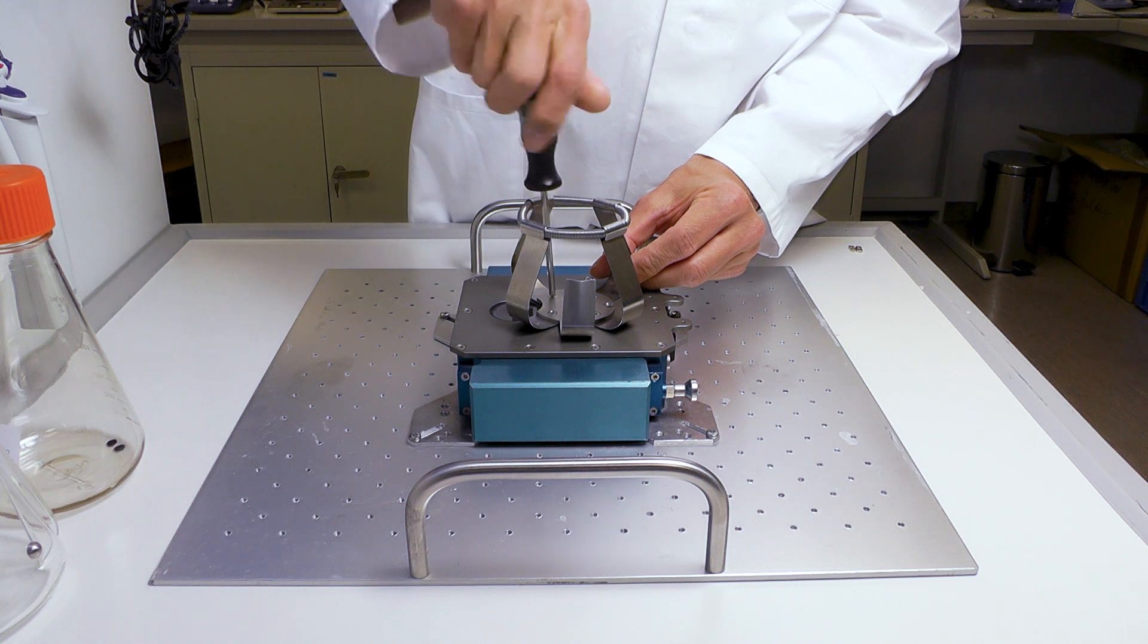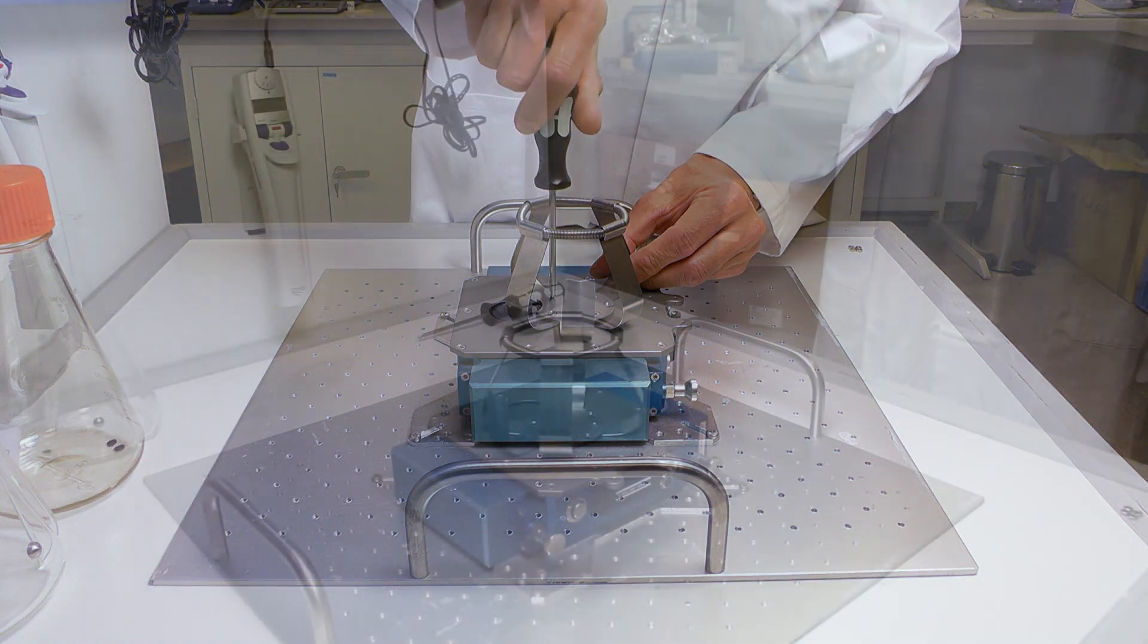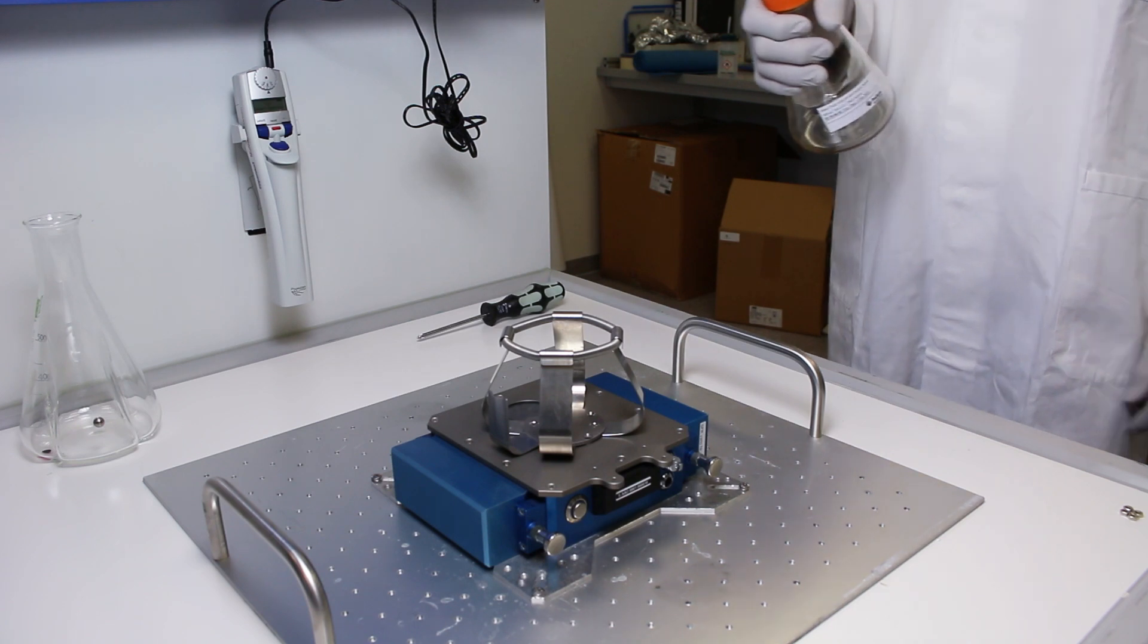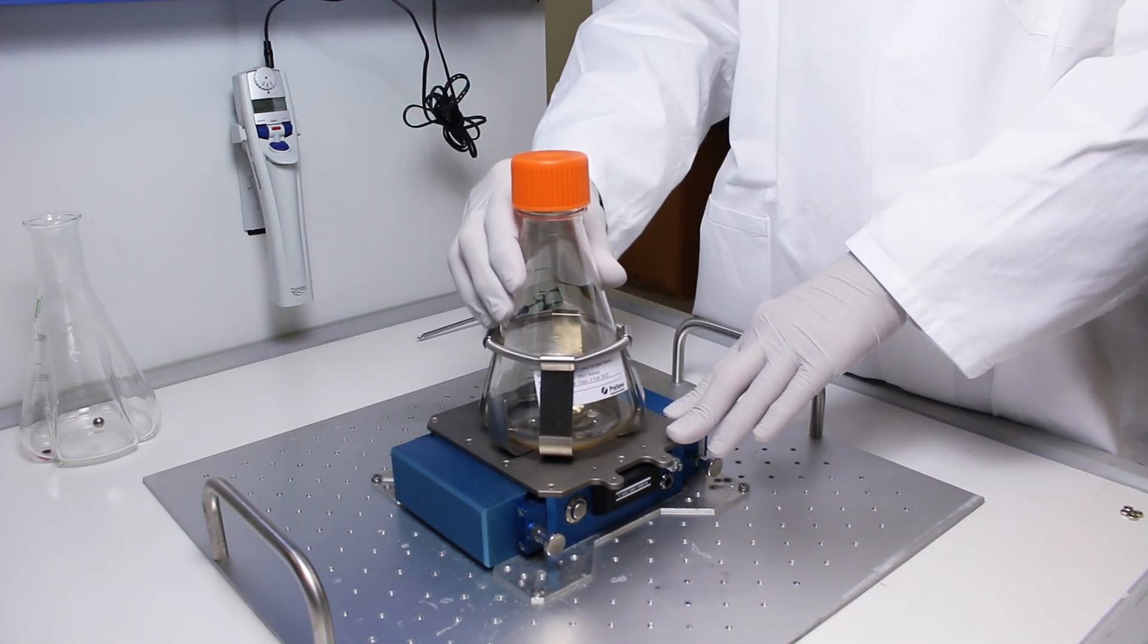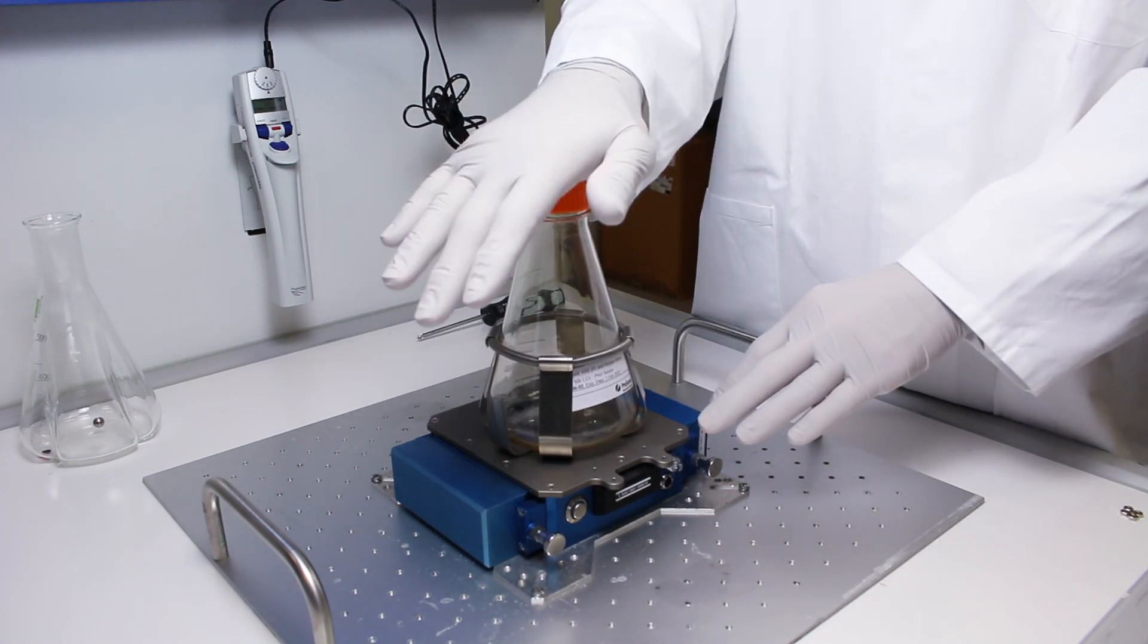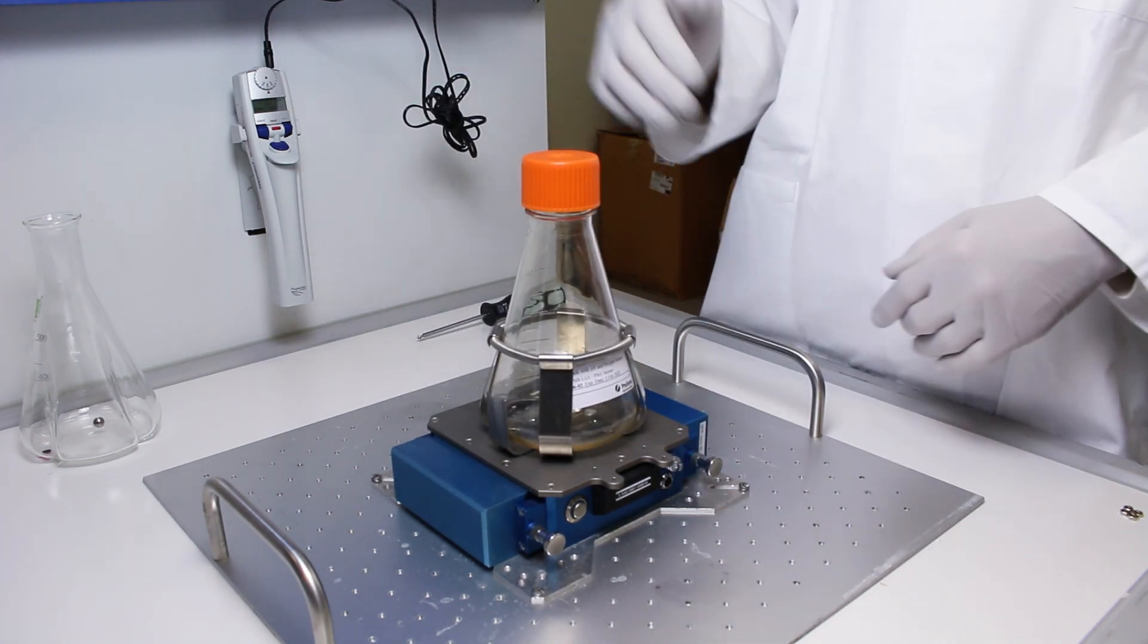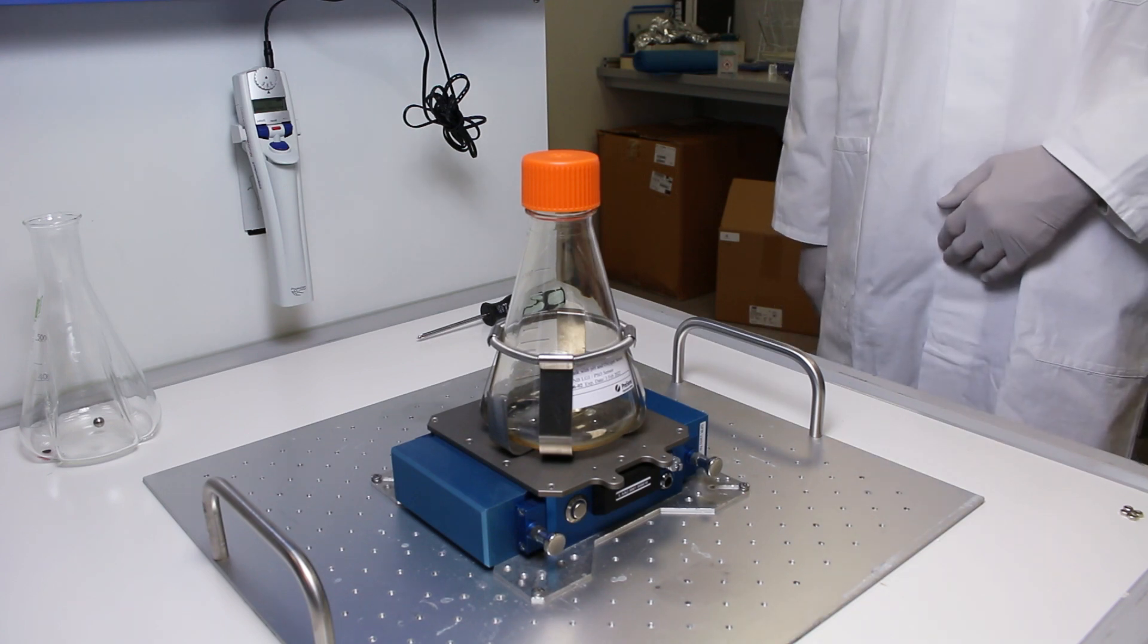When the clamp is attached to the reader you can insert your sensor flask. A plastic sensor flask is put in the clamp and then turned until you feel the two knobs on the flask bottom snap into the holes on the base plate. To make sure the flask is properly inserted press down on the flask once more.